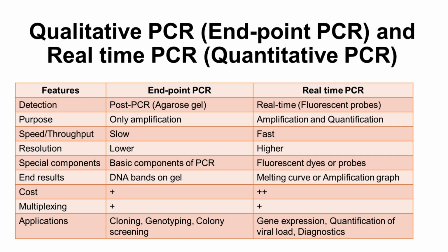What I mean by resolution is, if I have a very low number of targets in my sample, which is the best technique that I can use for low copy number templates? Endpoint PCR will not be much appropriate. Here real-time PCR gives a better resolution than endpoint PCR.